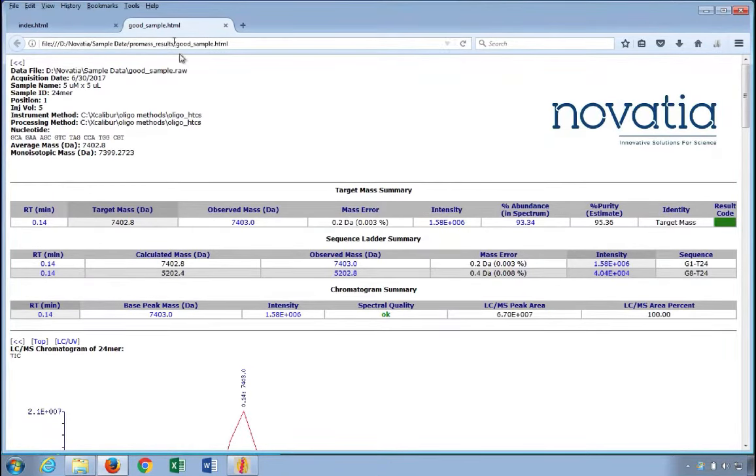From the index page, most of the links take you to the top of the detailed report page for a specific sample.